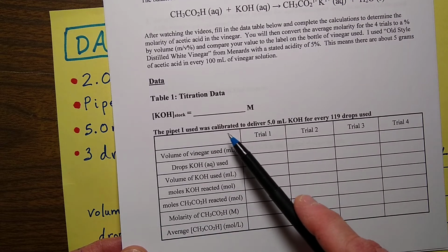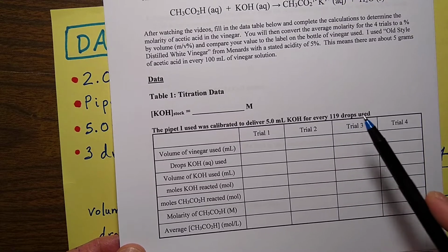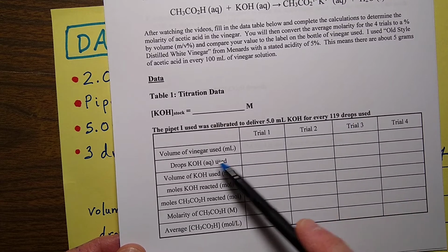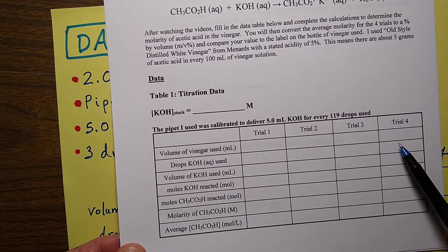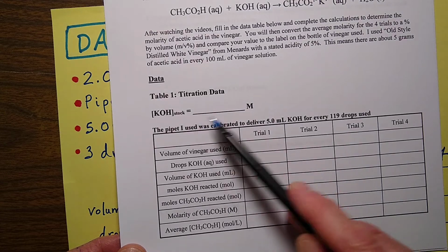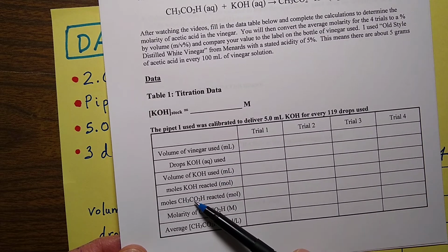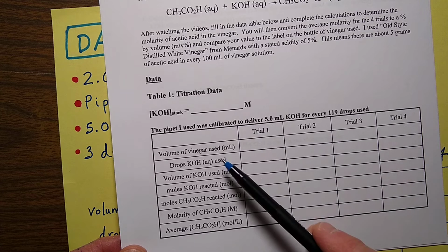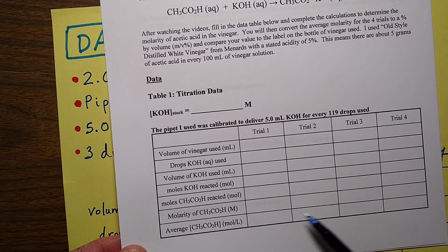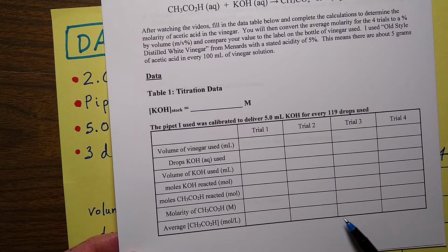And again, here's the information you need that's key for converting drops to volume. The pipette I used was calibrated to deliver 5.0 milliliters of KOH for every 119 drops used. So make sure you use that conversion factor to convert each of these drops that you'll fill in here to volume, and then you'll convert volume to moles using this number, and from here to here it's the same number. Then you'll divide this number by the volume of vinegar, but make sure you express that in liters, and then you'll average all 4 of those trials and report one number here. I have 4 columns, but just put one number here.